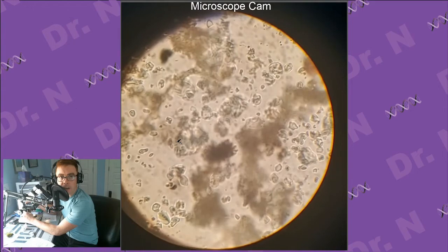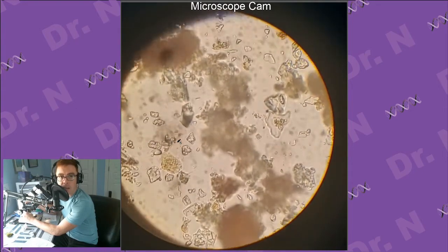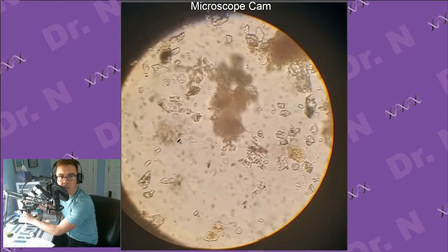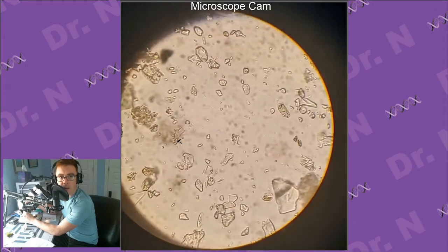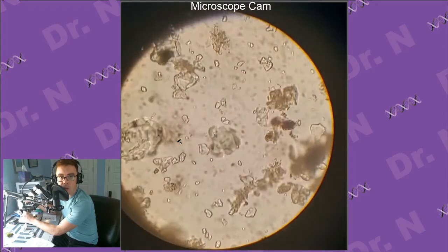So if we look very carefully, that's going to be bacteria, but those are going to be way too small. But those paramecium are pretty easy to see when we do see them. More amoeba looking guys, but they're not really moving. So given the time, I've scheduled myself to have 2 hours for this stream.